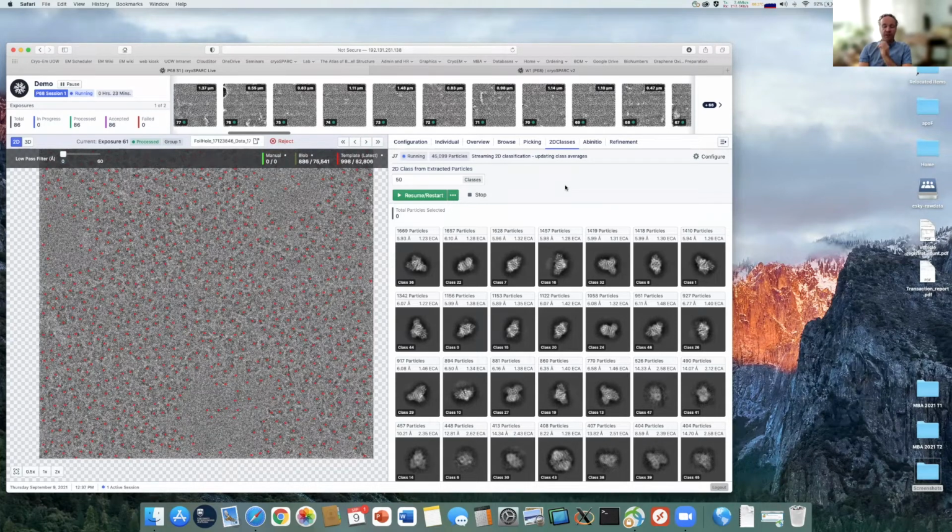We also spec'd this out with 6 GPUs because we knew that 3 was a minimum for cryoSPARC Live, and we have 2 instruments. We thought that if we ever lose one of our GPU boxes, it makes sense for our 6 GPU box to be big enough that we can serve both instruments. That's worked out quite well because we have been having trouble with our other GPU box, so we're dependent on this single box right now.